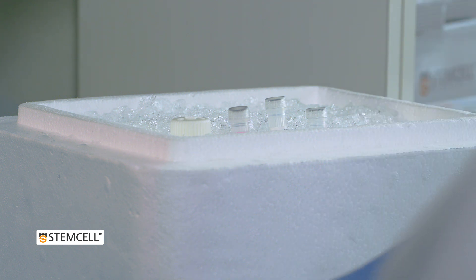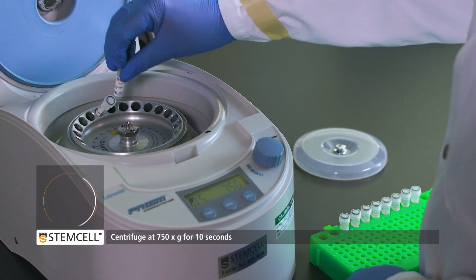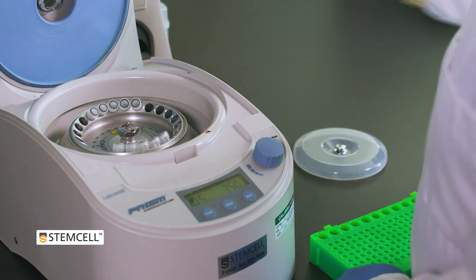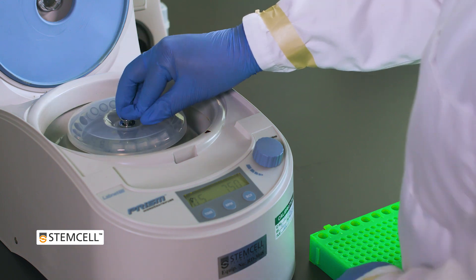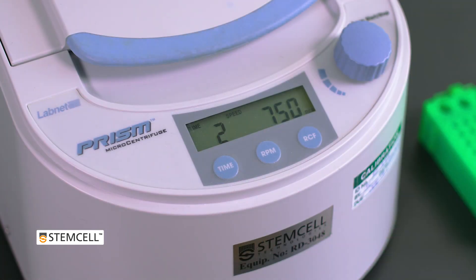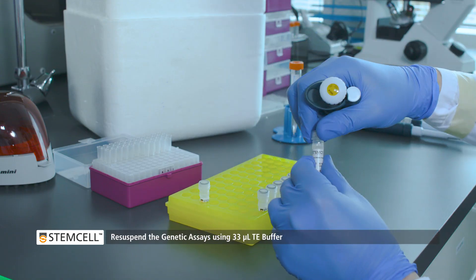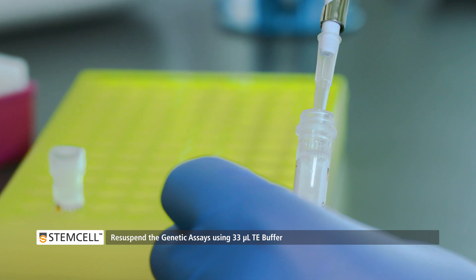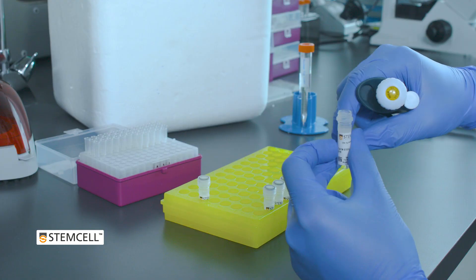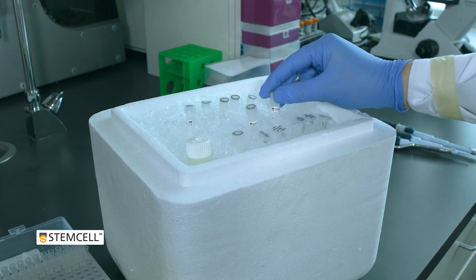Next, prepare the genetic assays. Centrifuge the tubes at 750 times G for 10 seconds. Then add 33 microliters of TE buffer to each tube. Pipet the solution up and down the sides of the tube to ensure complete resuspension. Return the tubes to the icebox and protect from light.